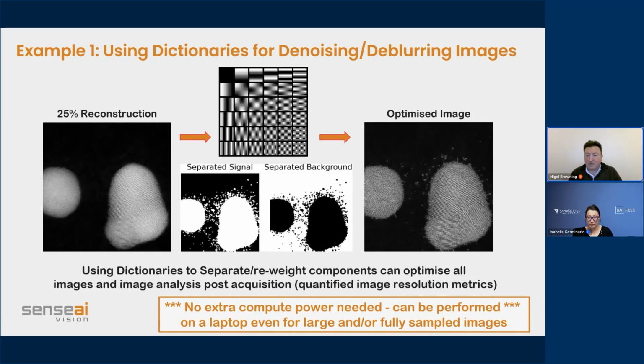that it becomes in the eye of the beholder at that point. So it's up to the person using the microscope or with the image to say which is the better image, because mathematically we can show that there are more accurate reconstructions to the ground truth. But to a person looking at it, they can't really see the difference. And that's why we always use that 10% bit.